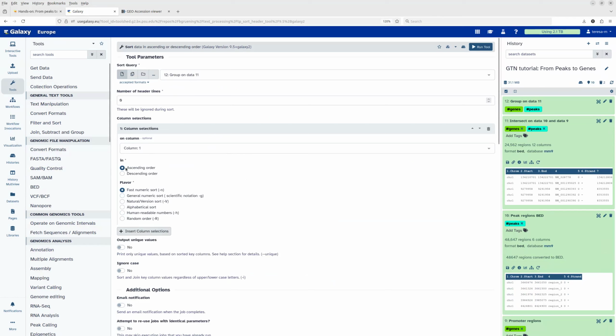And we want to sort in ascending order, that is also fine, but we don't want the numerical sort as it is at the moment. Like we have chromosome 1, but then chromosome 10, because 1 and 1 is in the numerical order, it comes after each other.